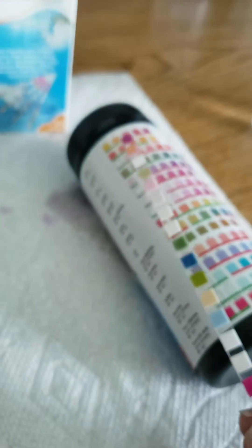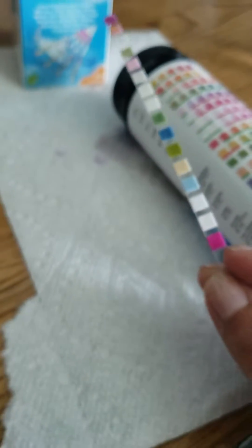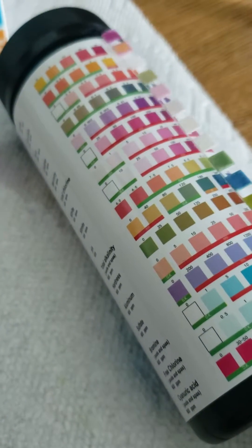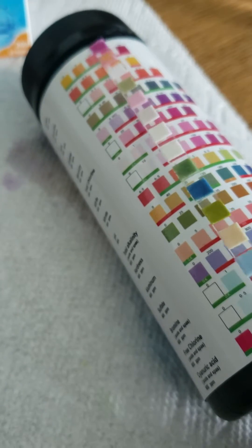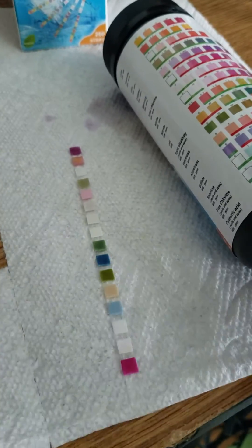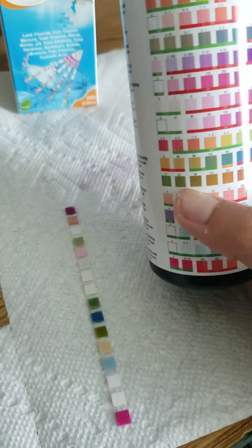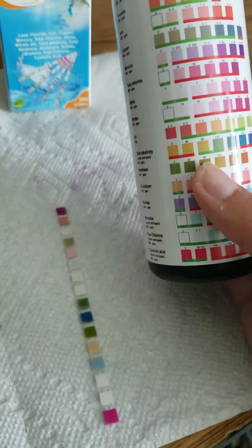So that's basically how you read your strip. You just dip it in your solution, wait 60 seconds, and then compare it to the color chart that's on your bottle. You go all the way across looking for the color that matches your pad the best. You have the EPA max limits built into the chart, so you can see if your water quality is good or if it needs improvement.